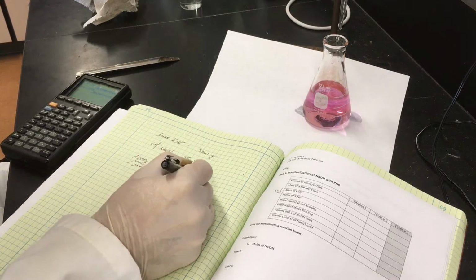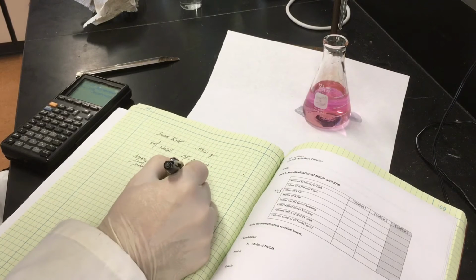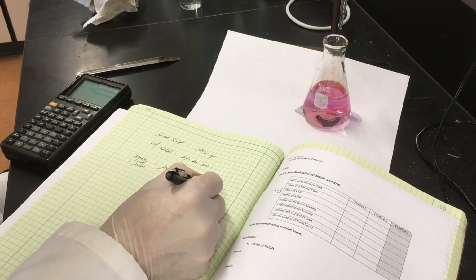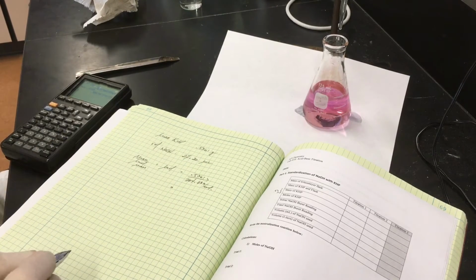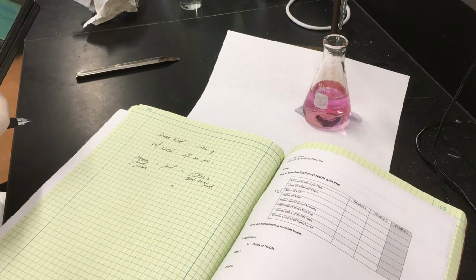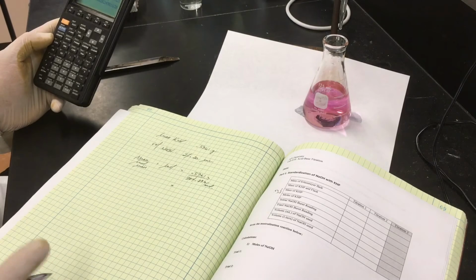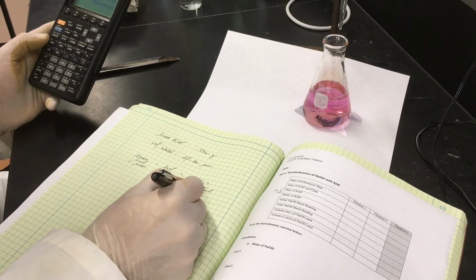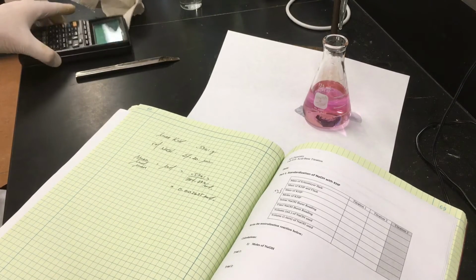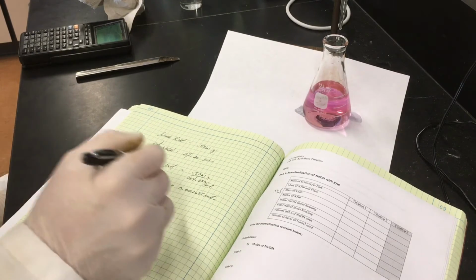And so the mass is 0.5361 grams, and the molar mass is 204.23 grams per mole. And so therefore that's going to give us our number of moles, which is 0.002625. And so those are moles of KHP, which at the same time are the moles of NaOH, because the moles of acid are equal to the moles of base.